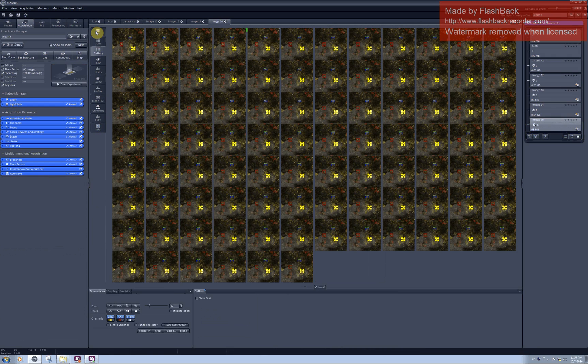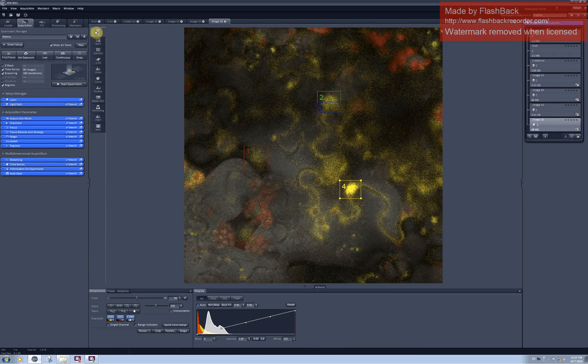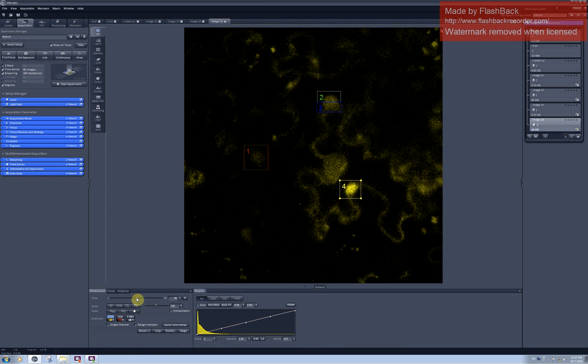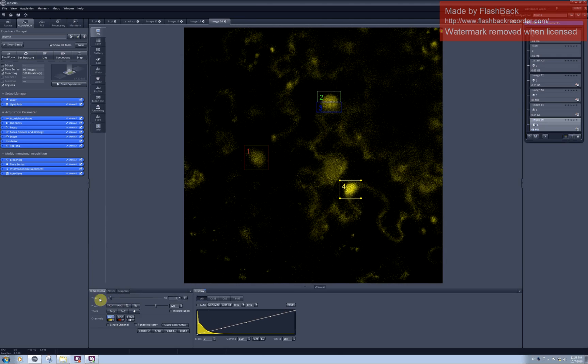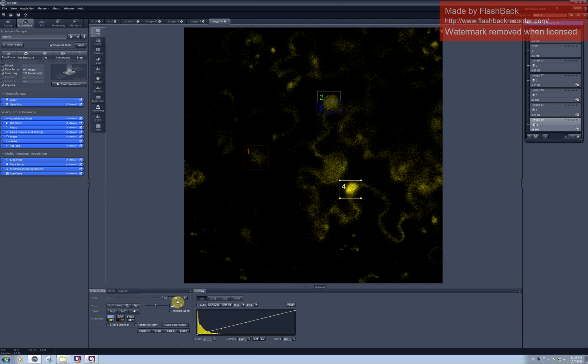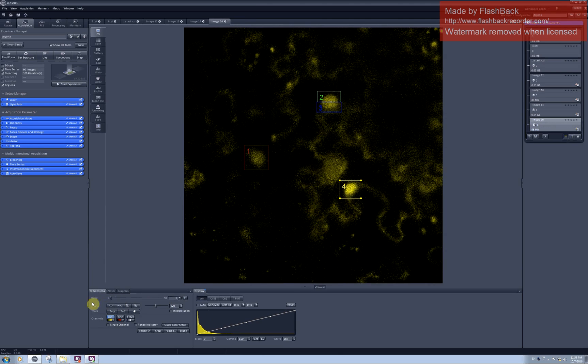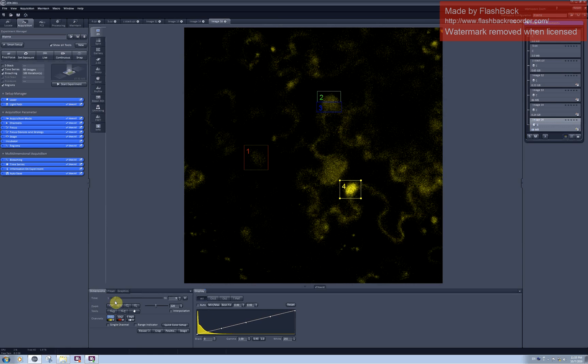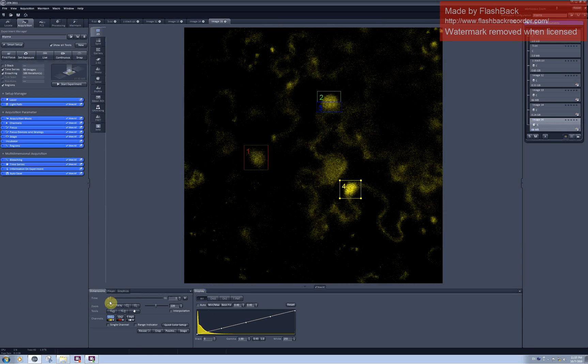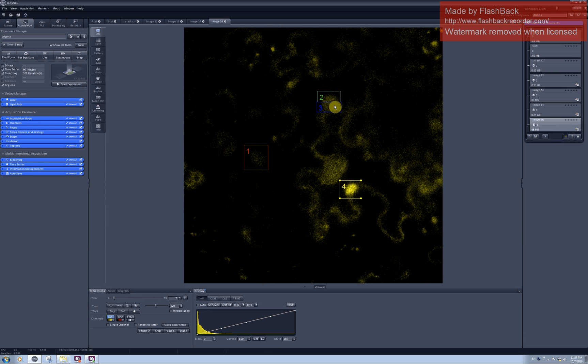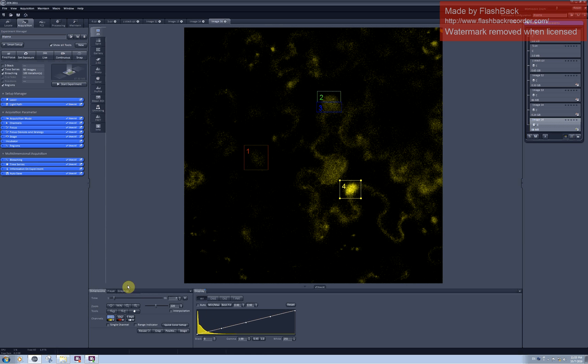In the 2D tab I can scroll through the time series of my photobleaching and see the efficacy of photobleaching. So you can see that in the area number 1 I lost quite a lot of signal. And I also lost quite a lot of signal in the area number 2 and 3, while number 4 remained as bright as it was.